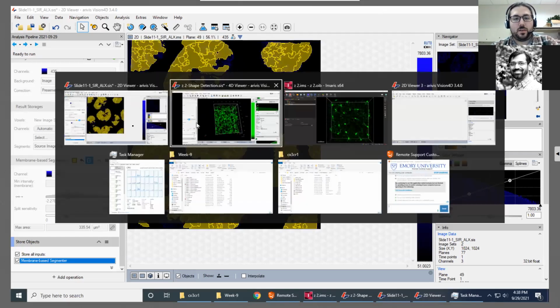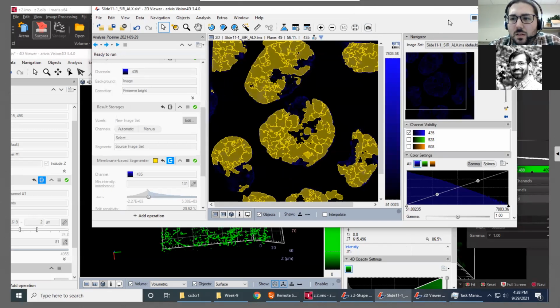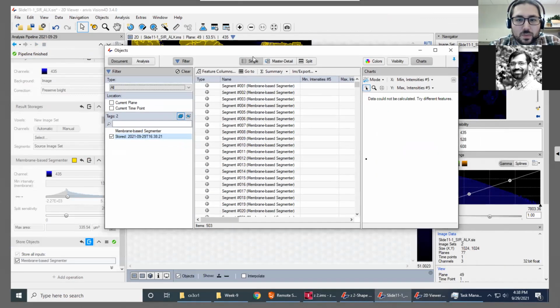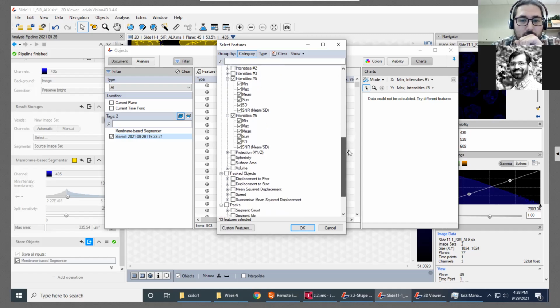And from here, we can take a look at these statistics that we got. In the same way that Imaris, you could modify what kind of statistics you get shown. You can do that here as well.